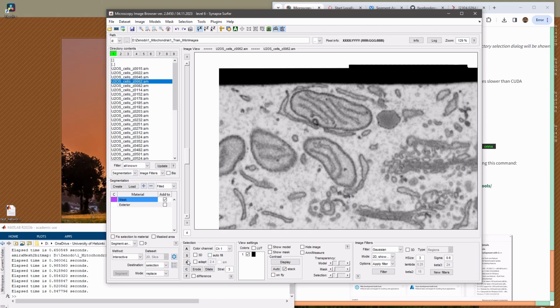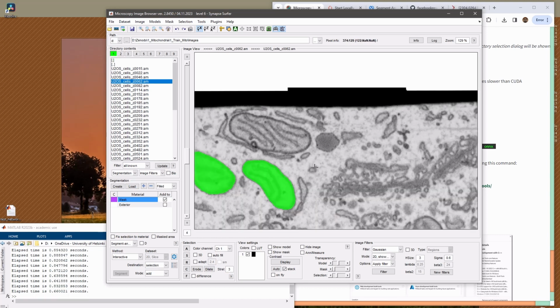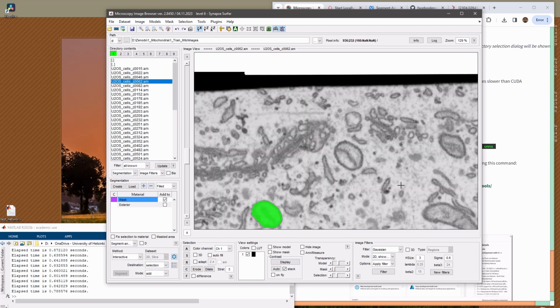Okay, the next mode is called add. When I click and then I click again, it will actually add up the things. So let's see with the control, for example this one, let's make a control click here, let's get this guy, control click here, let's take this mitochondria. Well, I'm not sure how good it was. Maybe here, then this one.